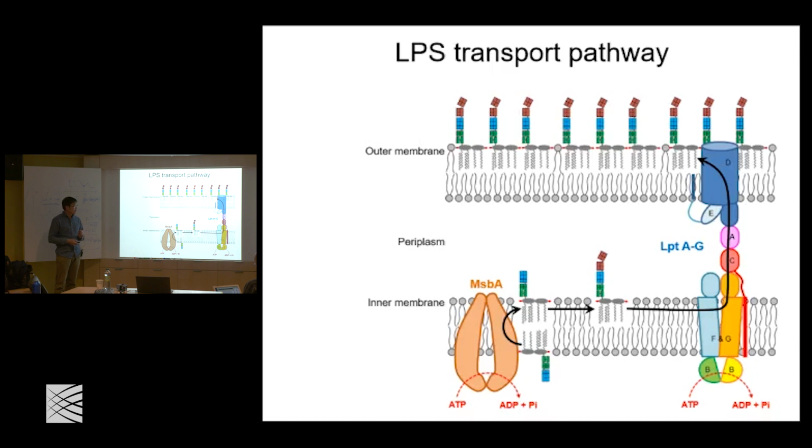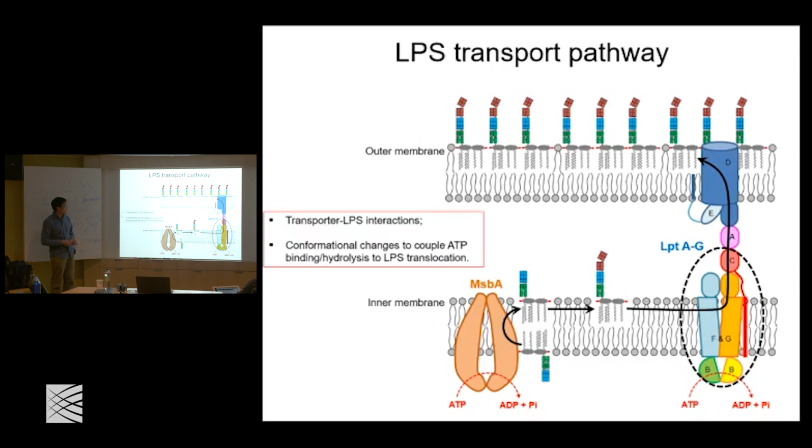For our study, we focus on this minimal ABC transporter and also the transporter associated with C. So first, we'll look at the BFG.